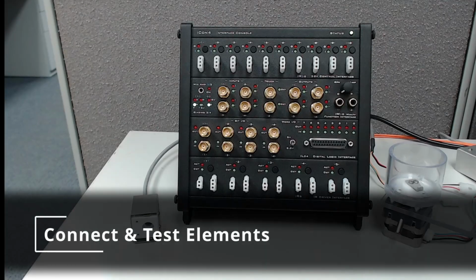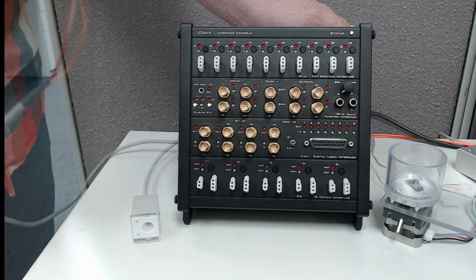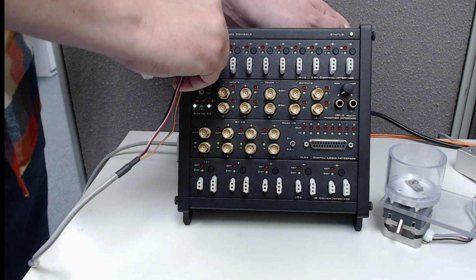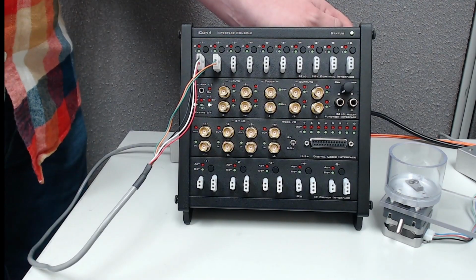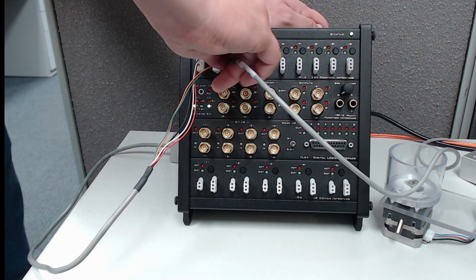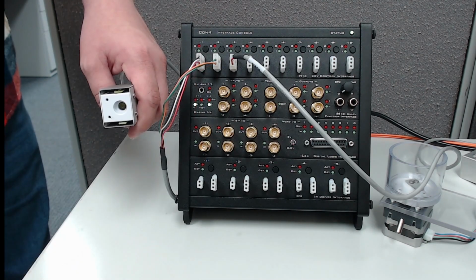For this tutorial, I have a single nose poke detector with an LED indicator and a pellet dispenser, both connected to an IH10 with Molex connectors. The nose poke sensor input has 3 pins, and the LED output has 2 pins. Each port on the IH10 has buttons for testing the outputs and LEDs for monitoring inputs.